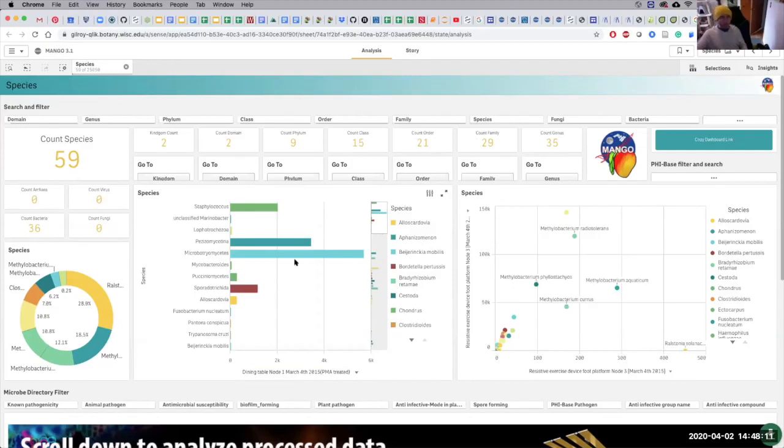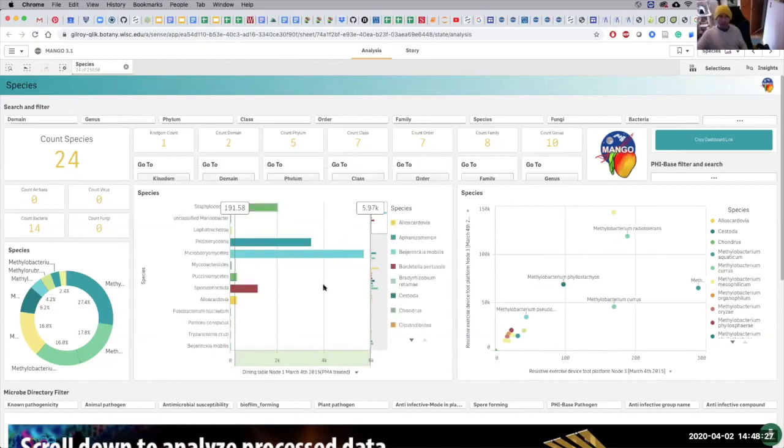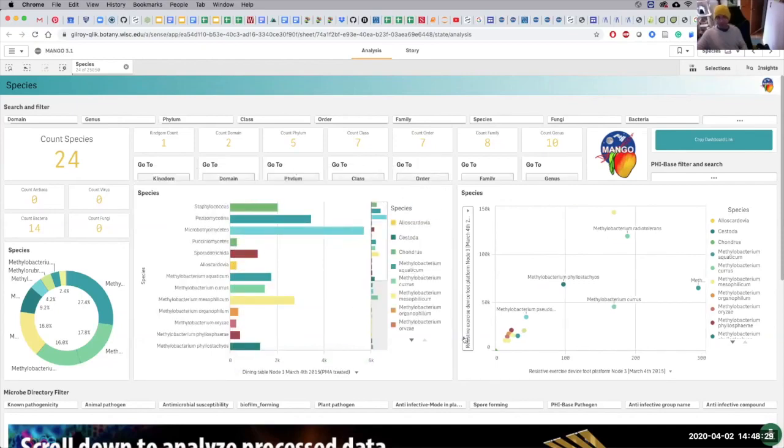So there we go. Now we've selected all the ones that are expressed a little bit at that location, that are found there. Not expressed, sorry. That's me thinking about genes again. Once a geneticist, always a geneticist-ish. So now I'm just going to go down a few layers, the top 24. Again, we've got a pairwise comparison here.